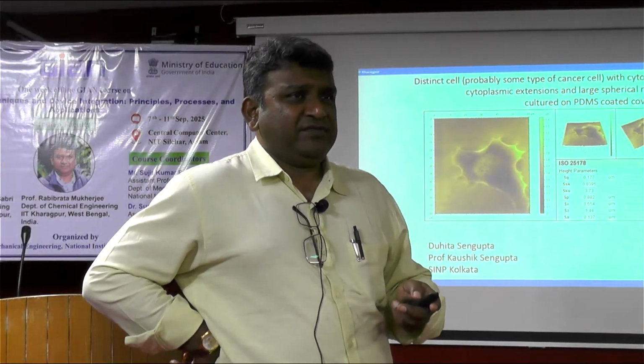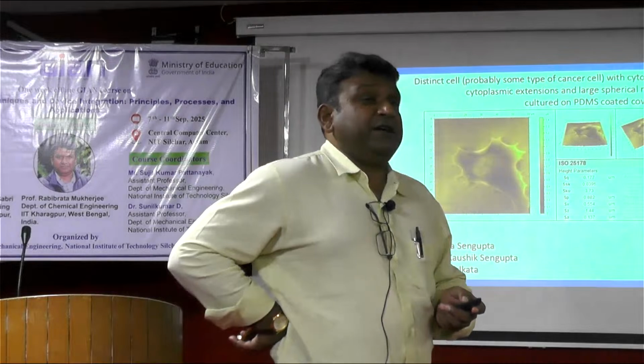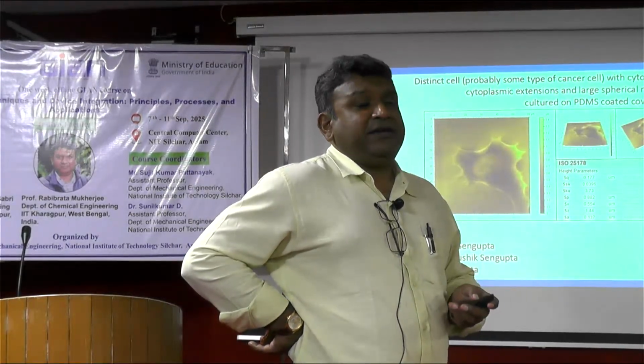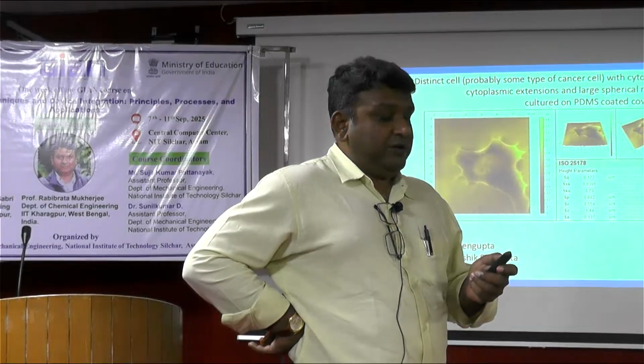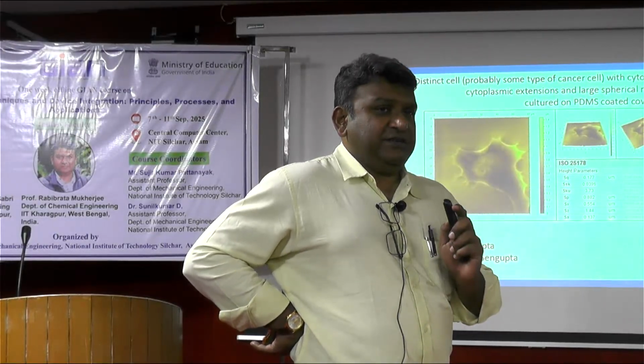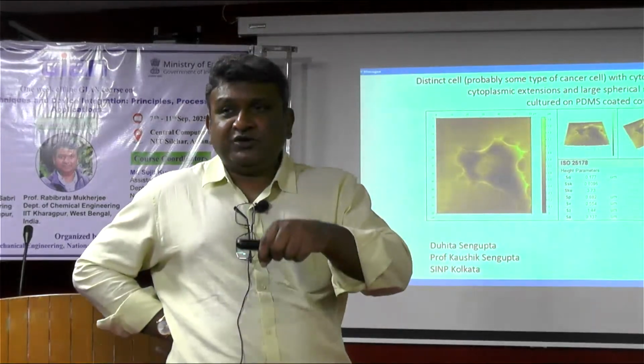What is the cost of this microscope? It's much cheaper as compared to your HRTEM or something like that. In INR, it's about a crore. You get a pretty good AFM. But operating an AFM is a little tough because a tip actually goes.